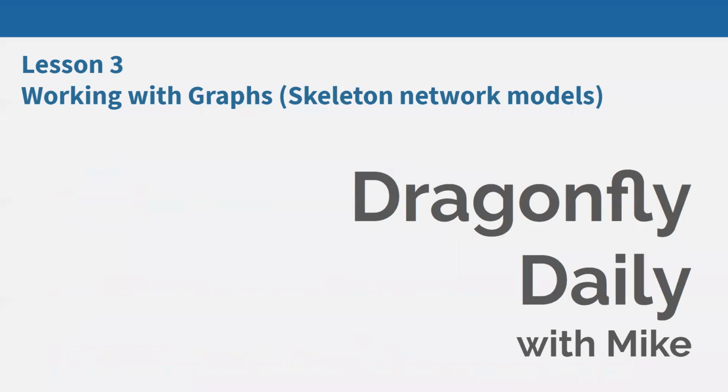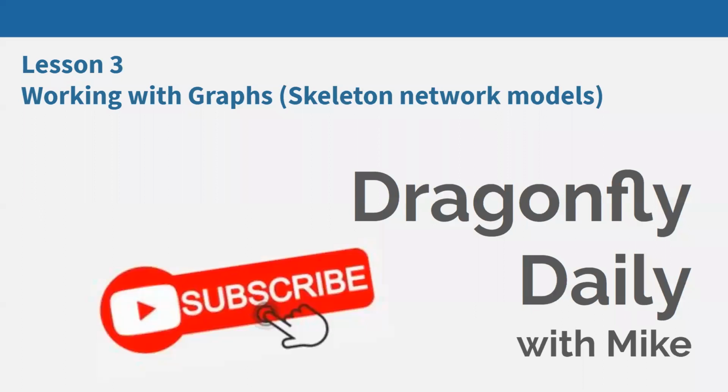Today's topic is working with graphs. We're going to look at a topic that probably most Dragonfly users don't actually use, but it is useful for a number of different domains and applications.